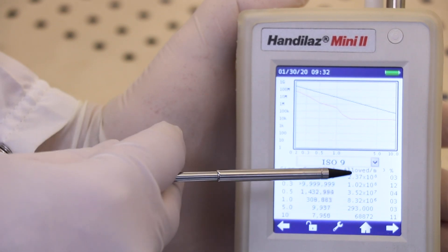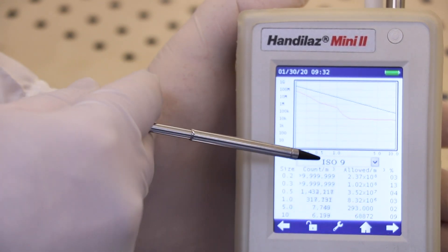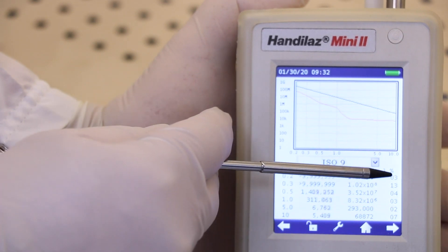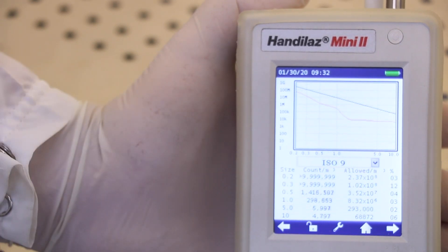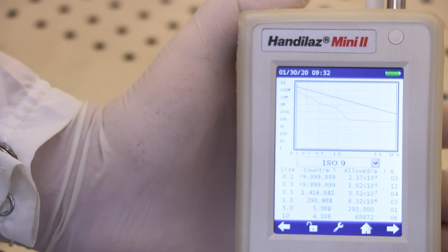The column to the right is the threshold count level per particle size, and the rightmost column is the resulting percentage of this threshold. If the number exceeds 100%, then we don't meet the requirements for the selected class.